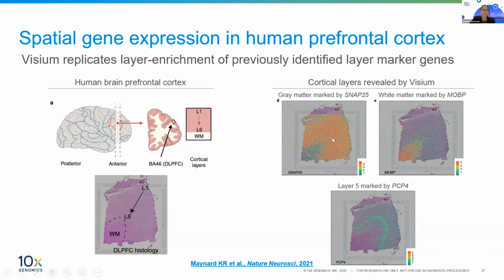So there is a method available that shows you how to score a tissue block to make it fit on our specific capture area, to really then allow you to analyze your tissue, and later on you can put that information back together bioinformatically.